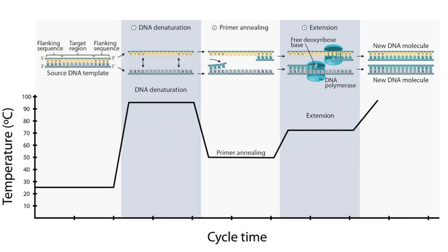So again, the second element necessary for PCR is knowledge of the flanking sequences to the target that will be amplified. The third element necessary for PCR is DNA polymerase. You can see DNA polymerase right here. Finally, the fourth necessary element is deoxynucleotide triphosphates. You can see that deoxynucleotide phosphate bases are shown right here. Okay, now let's cover the 3 steps of PCR.